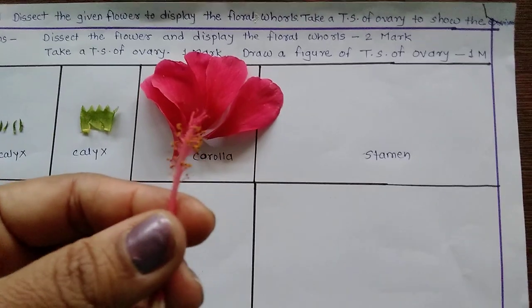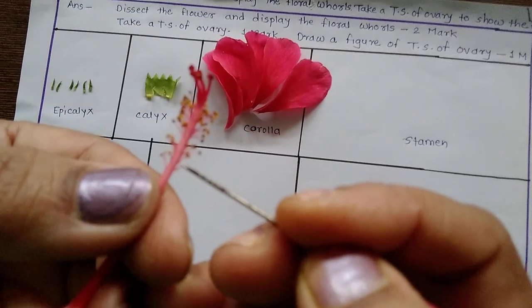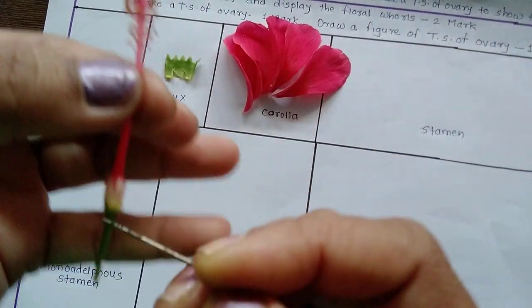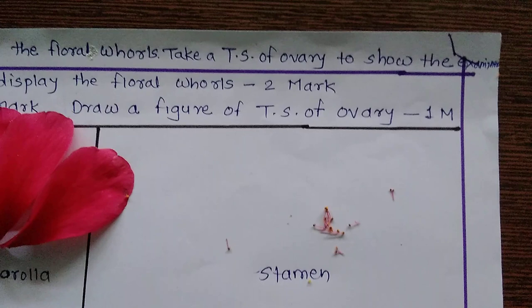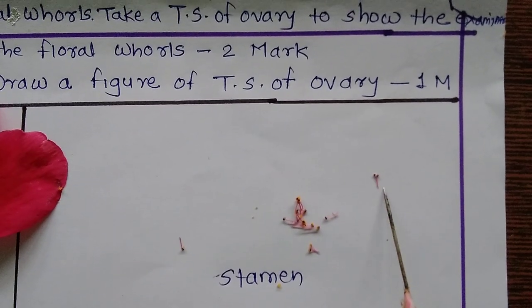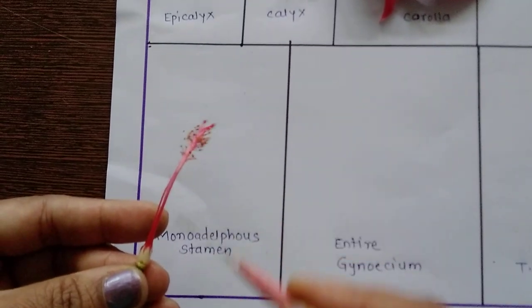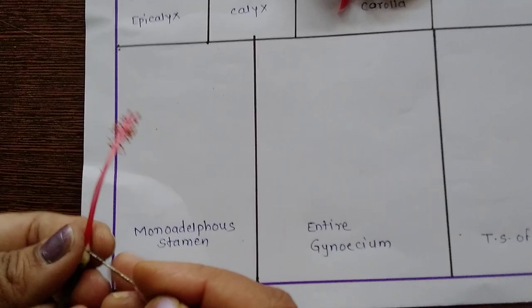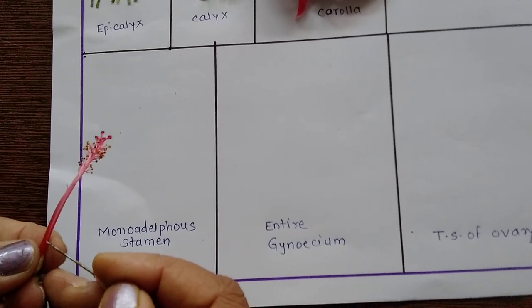Next is the stamen. The stamen has kidney-shaped anthers and filaments. Many androecium parts are attached to a single tube, so it is called monadelphous stamen. The anther is the kidney-shaped structure and the long thread-like structure is called the filament. The number of stamens are attached on a single tube-like structure, so it is called monadelphous stamen. Separate this monadelphous stamen by taking a clean and careful cut.